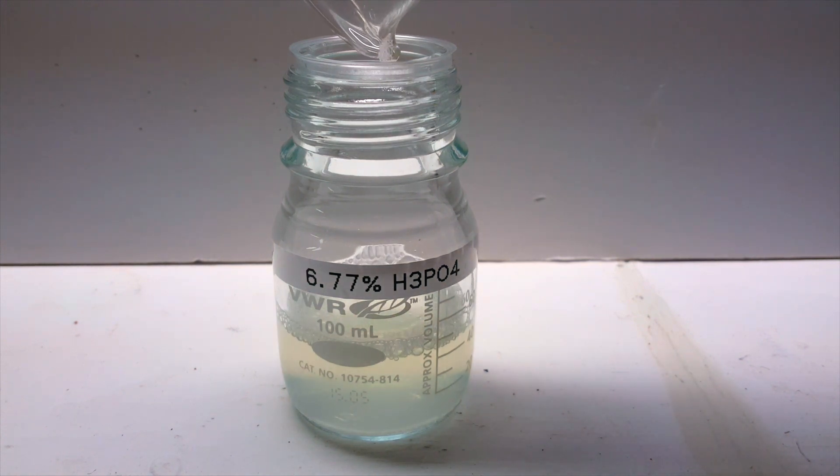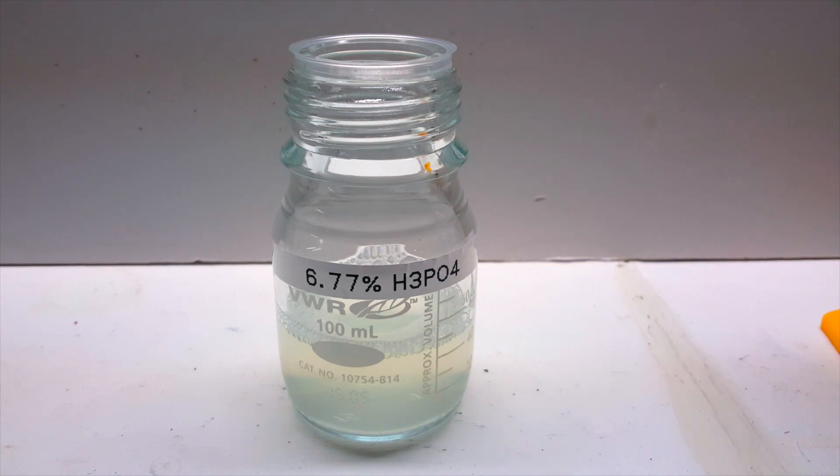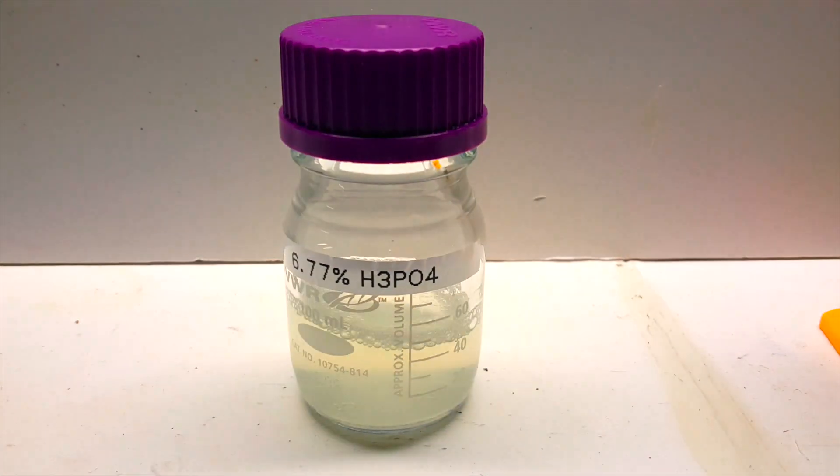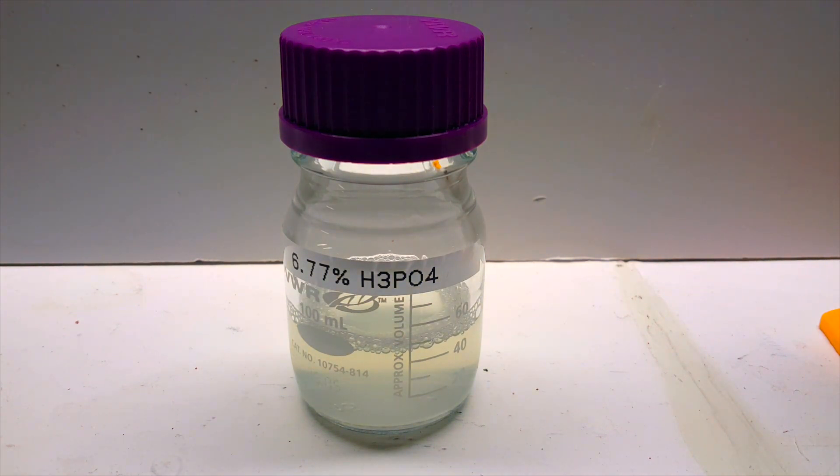I could have gone a step further and concentrated this phosphoric acid some more by running another distillation, but I chose not to because this first run took over 13 hours over the course of three days. If I needed more concentrated solution in the future, I'll go ahead and distill it again, but for now, this is as far as I'm gonna go.